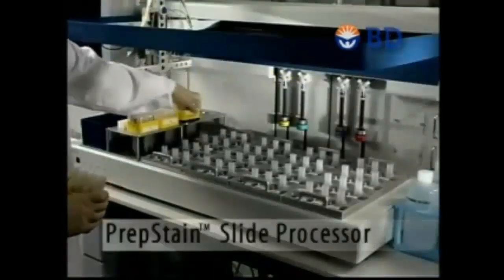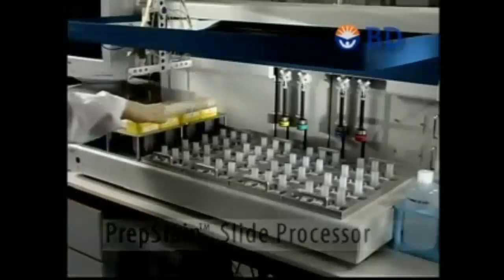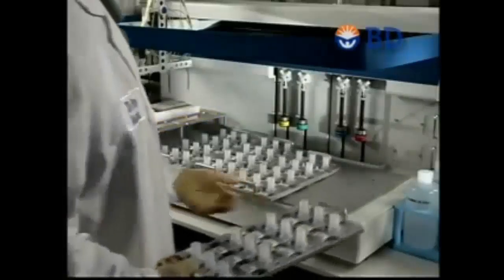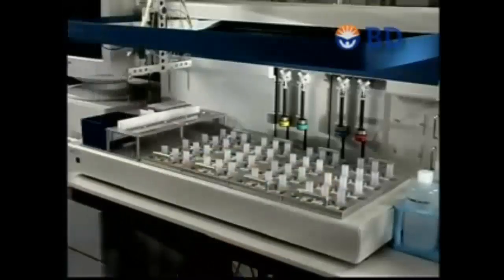Centrifuge buckets containing tubes are loaded directly into the PrepStain sample area. Labeled slides are placed directly onto the PrepStain slide processor. The processor can hold up to 48 slides per cycle. Note that all tube and slide racks are keyed and can only be inserted in the correct position.